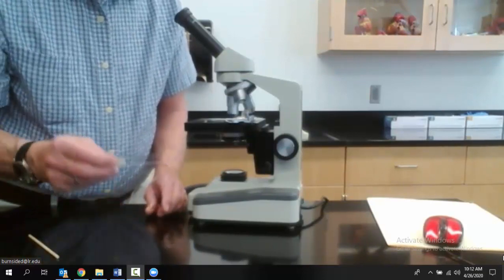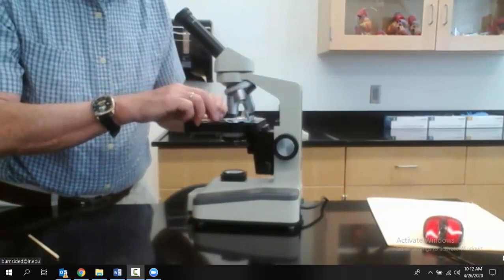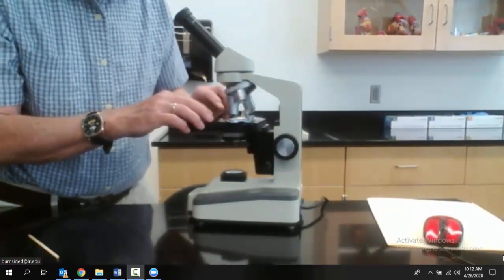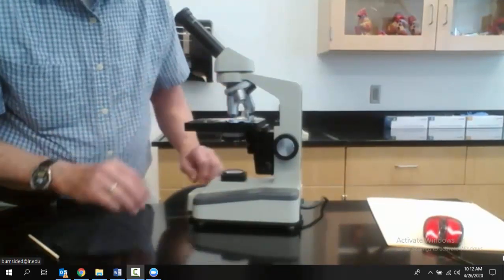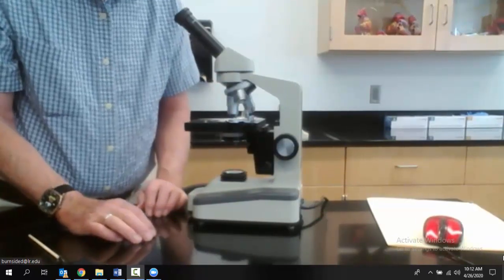What we do with this slide, which has a section of the tissue on it, usually with some kind of stain, is put it onto the stage of the microscope. We position it; we have knobs on this microscope to position it.